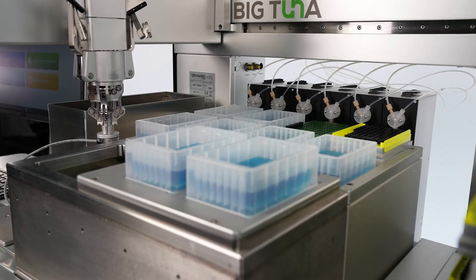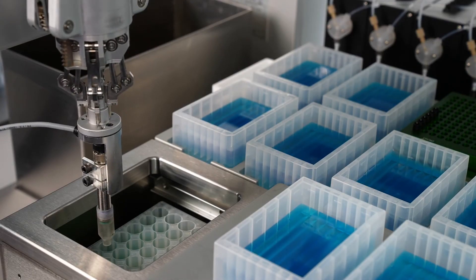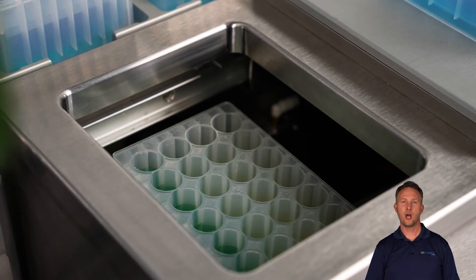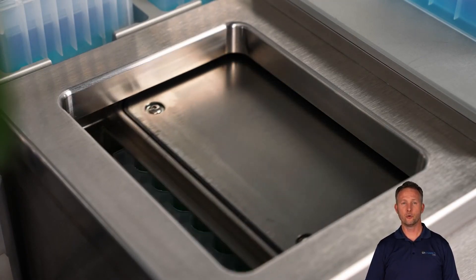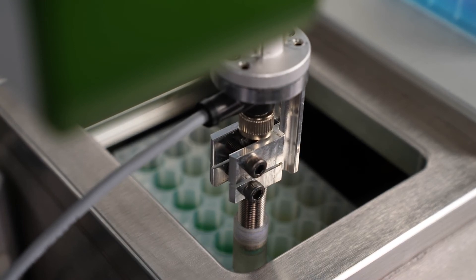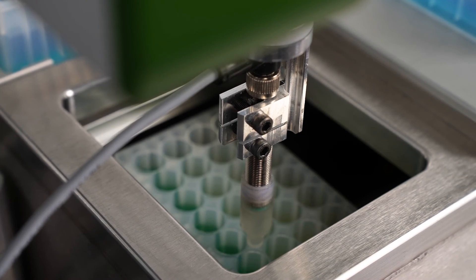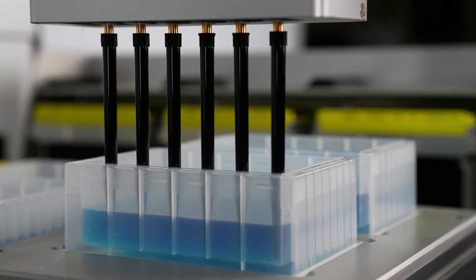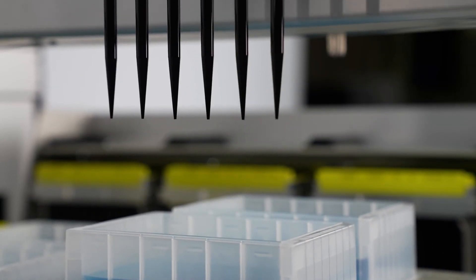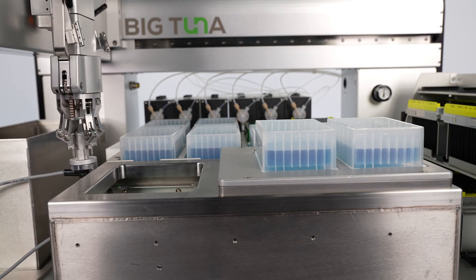Place the prepped Unfilter into the buffer exchange chamber and Big Tuna will kick off the run by measuring the initial volume using its acoustic sensor. Next, Big Tuna's buffer exchange chamber applies positive pressure to remove filtrate. Once filtrate is removed after some pressurization time, the acoustic sensor measures the volume again to determine how much filtrate has been removed. Then Big Tuna will fill each well with new buffer to the initial volume automatically. This process is performed in repeated cycles until all the old buffer is displaced.